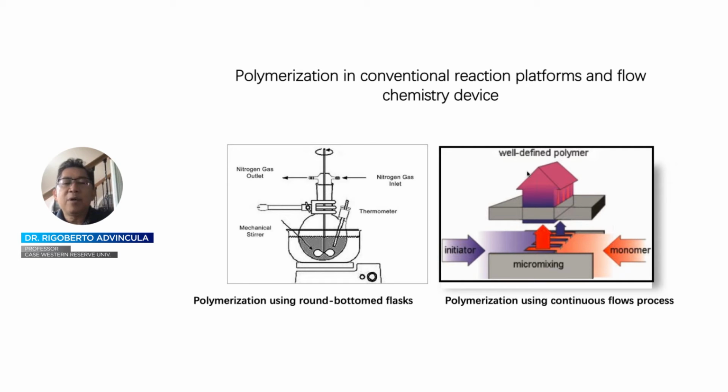Hence, one of the advantages of a continuous reaction or polymerization setup is that this is akin to turning on the tap and getting product continuously, and stopping the tap allows you to simply turn off the reaction and stop the production. Hence, if you don't turn off the tap, then you'll continuously produce the product.